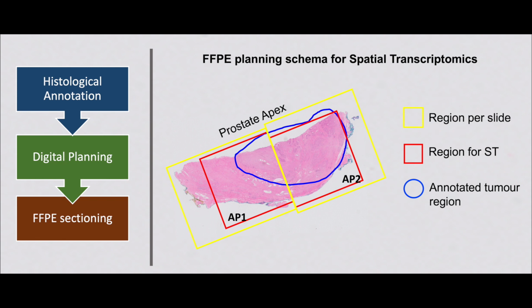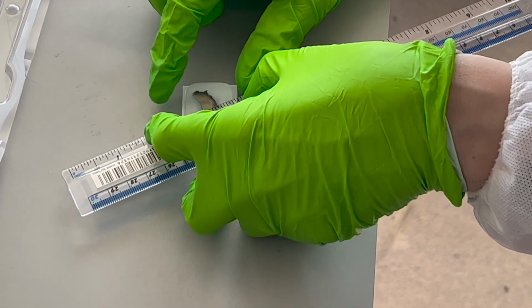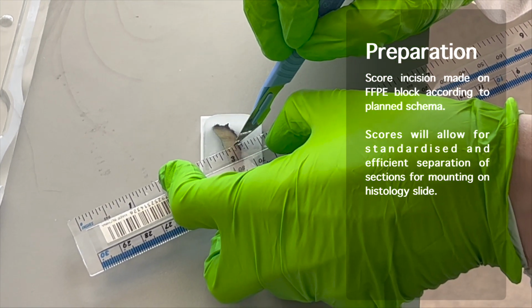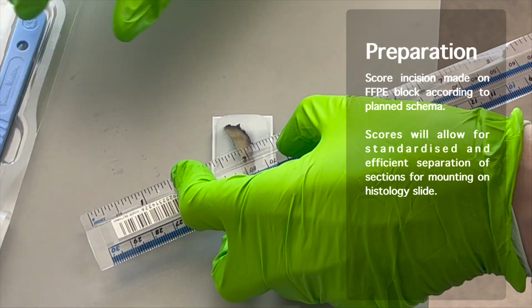Stage 3 involves sectioning of the FFPE specimen. With our digital planning complete, we take the next step where we directly superimpose the digital schema onto the FFPE block. The dotted line here represents the incision line for dividing the section to be mounted and processed for sequencing, which will be on separate slides. Here, we demonstrate scoring the incision line on the FFPE block using a scalpel. These scores will allow for standardized and efficient separation of sections for mounting on separate histology slides.